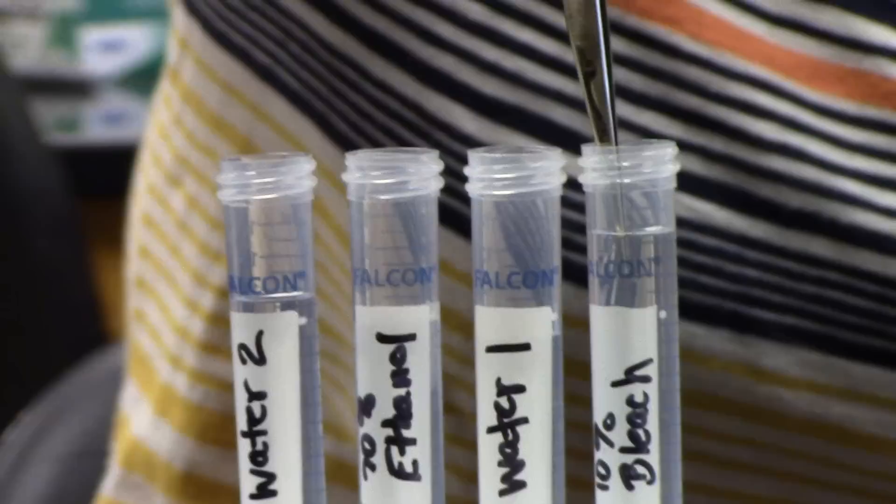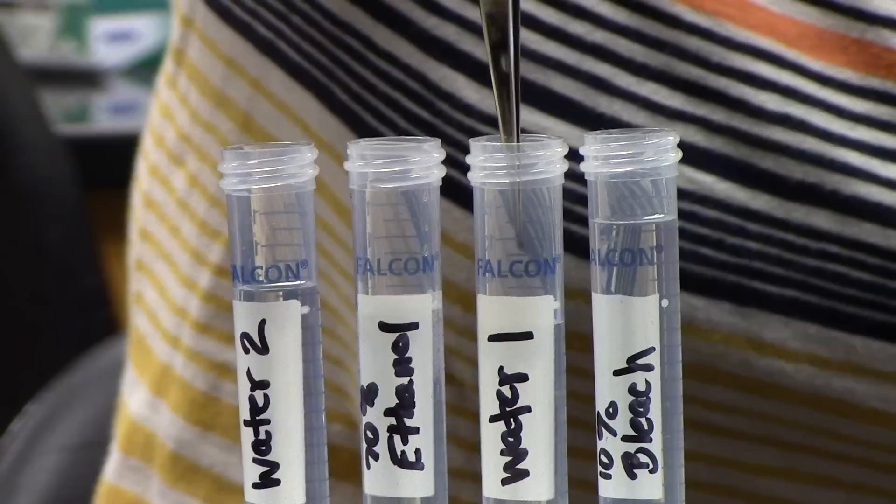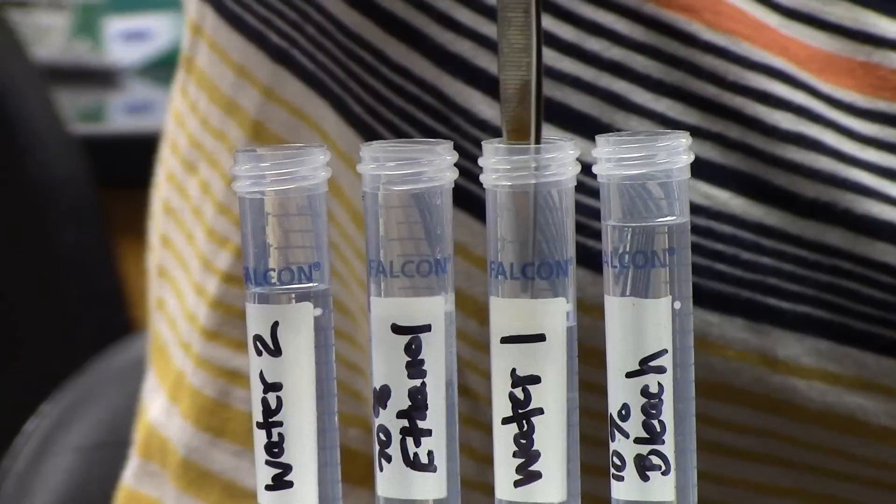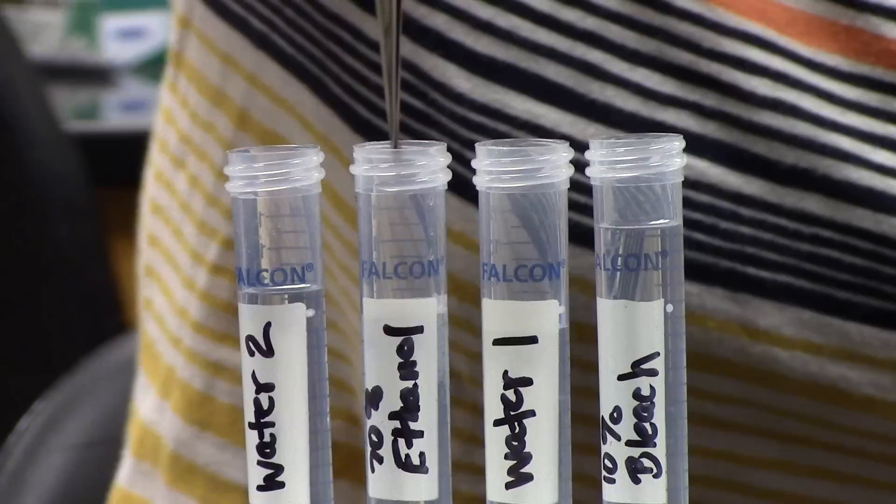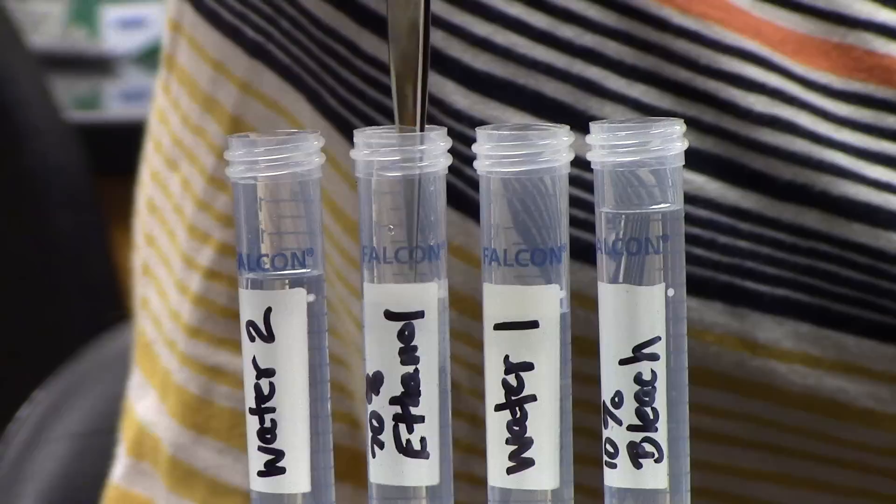Give it a little swirl to make sure that the entire thing is coated. Now move into the water to clean off the bleach for 10 seconds. Then ethanol for 5. And then water again for 10 seconds.